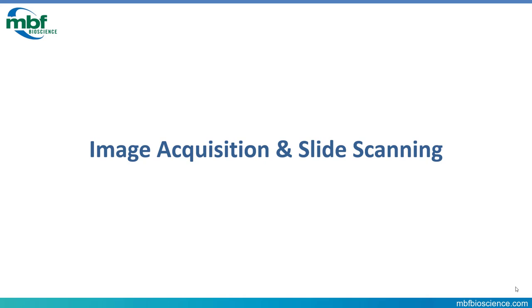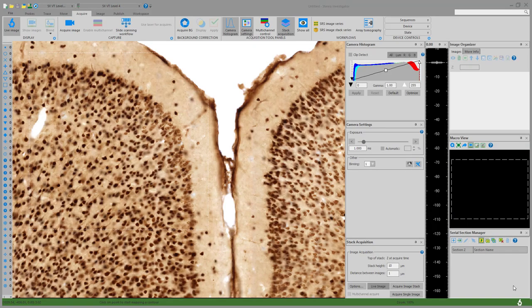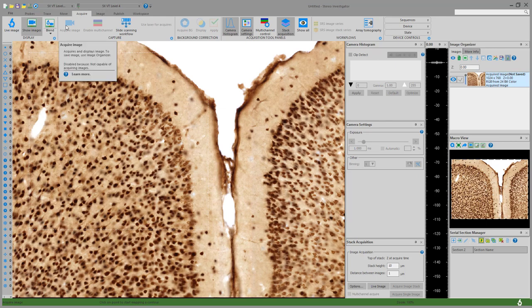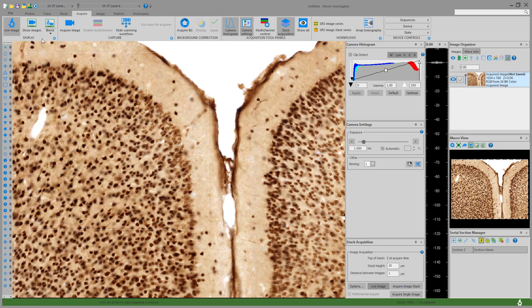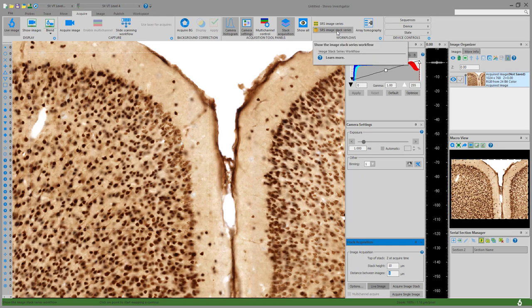Now I want to touch on one of the other major features in Stereo Investigator: slide scanning. Since we are connected to this microscope system, we can acquire images covering multiple fields of view and stitch those together just like a slide scanner. You can acquire a single field of view, do image stacks through the entire thickness of the tissue, or acquire SRS image stacks — acquiring those offline on a different system for efficient acquisition and then counting on an offline workstation. There's also an Image Organizer that shows the images you've captured with a brief summary and thumbnail.